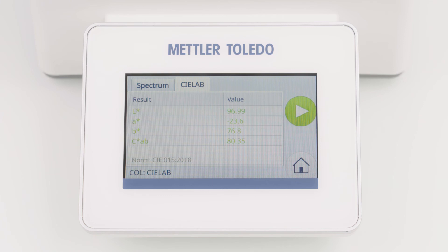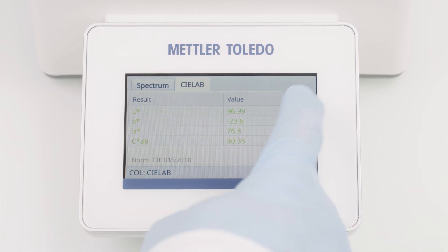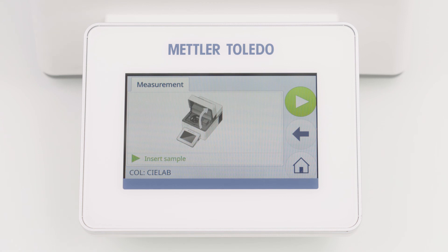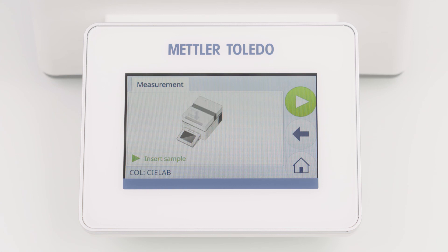To measure additional samples with the same settings, simply click the start button again. You are directly asked to insert the sample, because the blank measurement is stored for 7 days and no new blank determination is necessary, even if you are leaving the method. Simply follow the instructions to continue with further measurements.